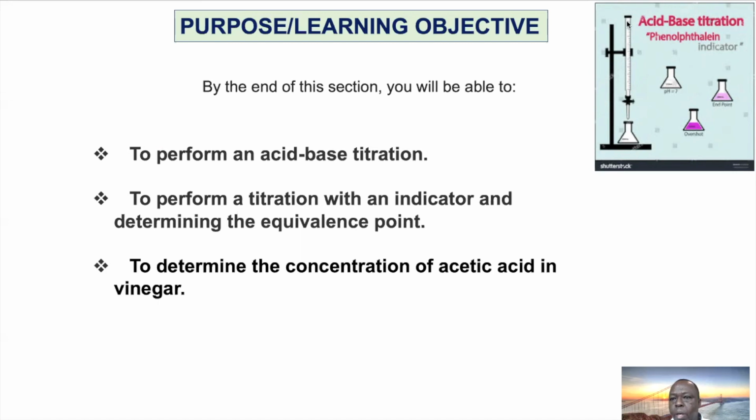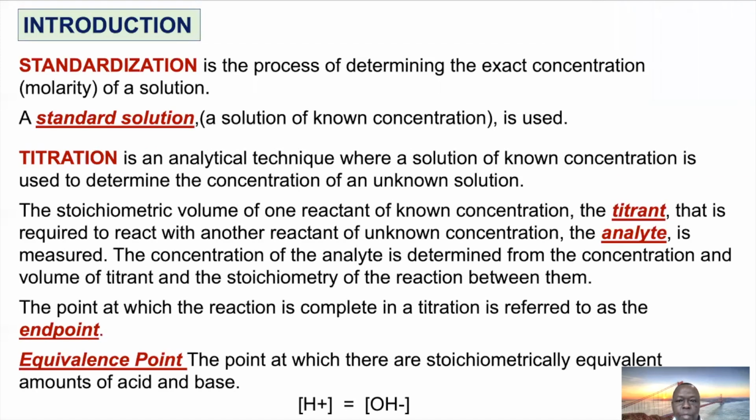which goes in where? In the burette. And at the end of the titration, once the exact concentration of the standard solution which goes in the burette has been determined, it is used in titration. The titrant is what goes in the burette, and the analyte is what you are analyzing. From the word analyze, what you are analyzing. What goes in the flask is our analyte, and the analyte today will be a solution of vinegar.